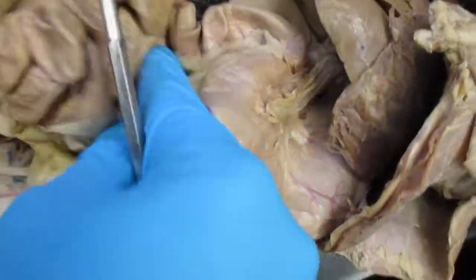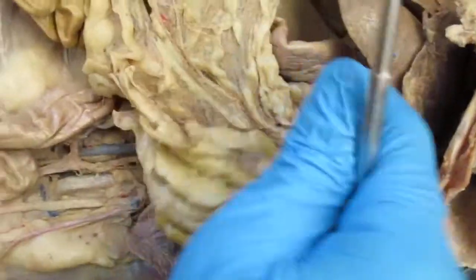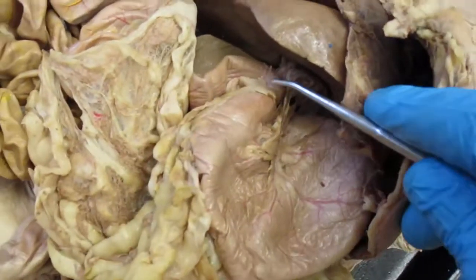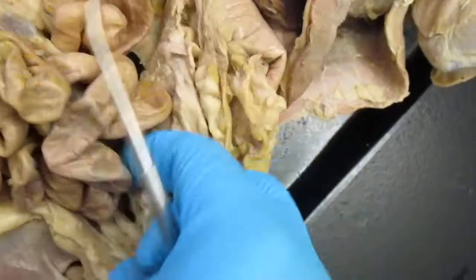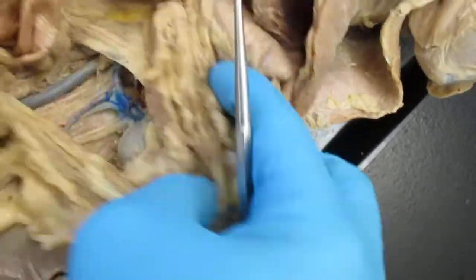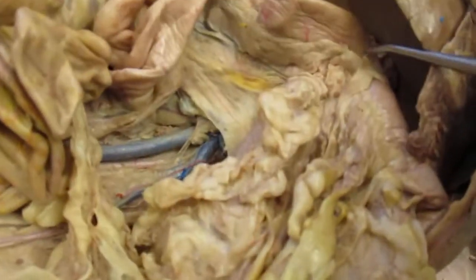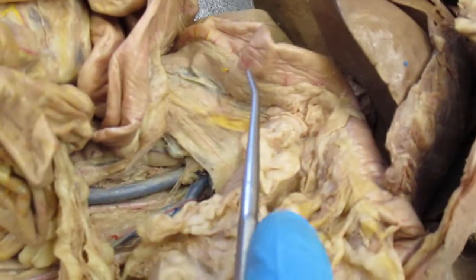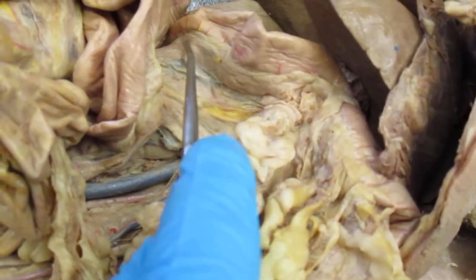and if you look at the very end of the stomach, you can see the pyloric region, which will be right in here. And let me expose the pancreas here. So you look for the pyloric region of your stomach, which would be right in here. And then you can see the first part of your intestines, your small intestines. Now that would be where the pancreas is.